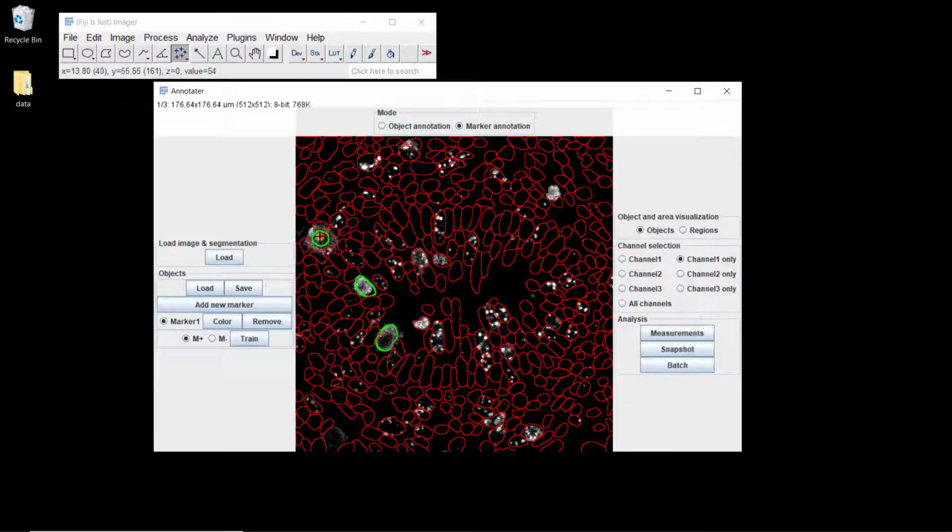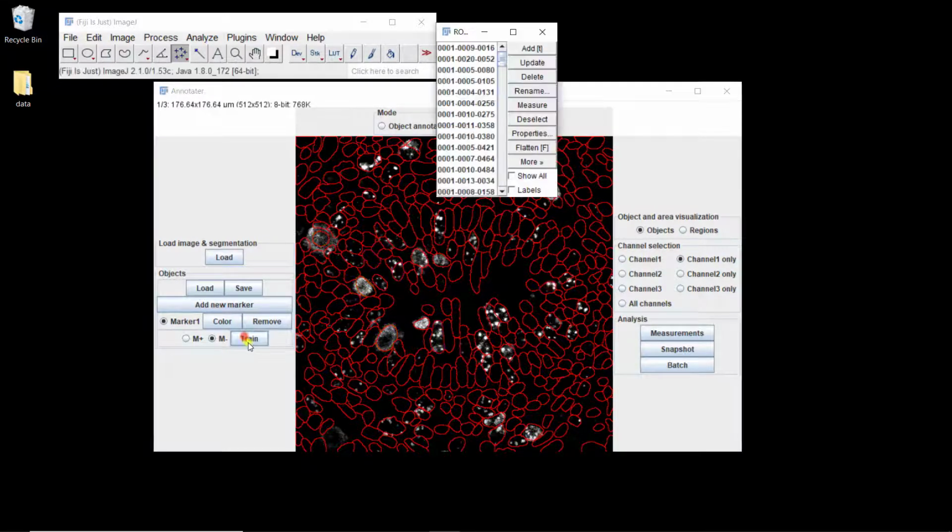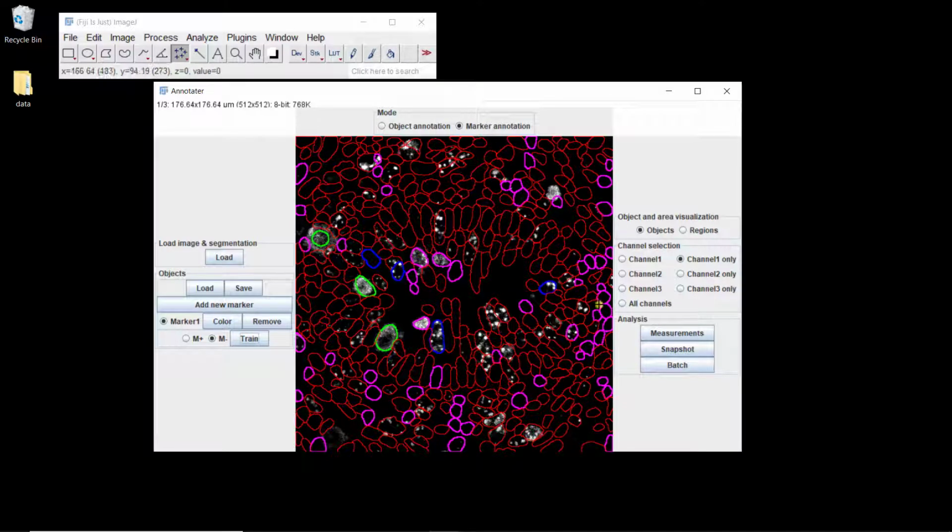If I want to have the diffuse, it's going to be a bit tricky because we don't have that many. So I define negative as punctate or nothing. Let's train it and see what it gives. Here we have way too many positive nuclei, so I'm going to have to define more negative nuclei. This as well. Let's try it again. And here I think it's fine. I'm not sure it's going to work on others. No, I missed one. Forgot this one.